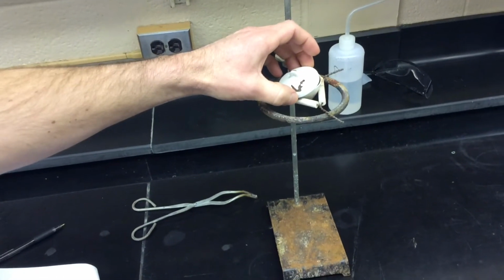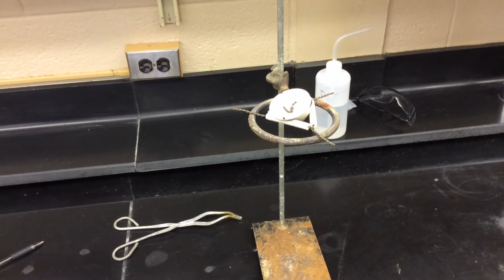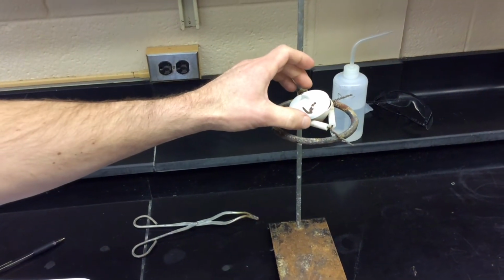Now, usually when people use crucibles, they say to use the lid, right? You put a lid on there to keep anything from splattering out. What's good about barium chloride dihydrate is it's pretty dense stuff. So when we heat it up, we don't really have to worry about little pieces of it flying out of the crucible. So we're not actually going to use the lid.